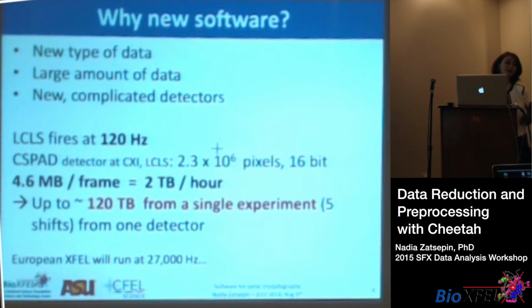Of course, you're never running continuously the whole time. You have to change samples, things can break, but that is a lot of data to deal with. And although data storage is cheaper and easier as we go along, it's a lot of data to sort through, clean, and treat. And then the European XFEL will come online, I think we'll be able to use this in 2017. That's a superconducting source that will be recording even faster, because more data.